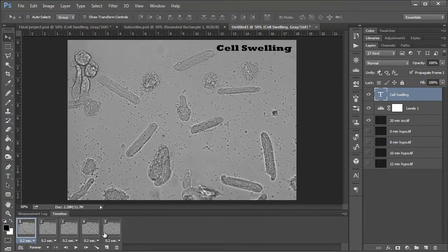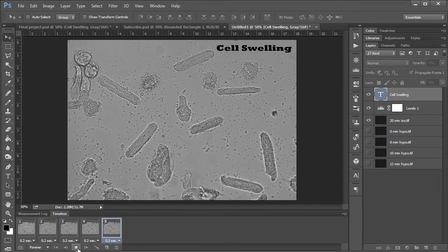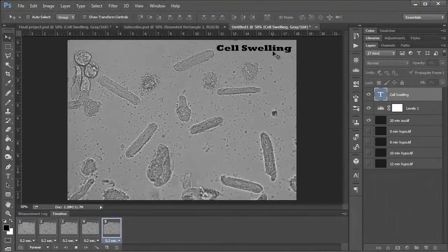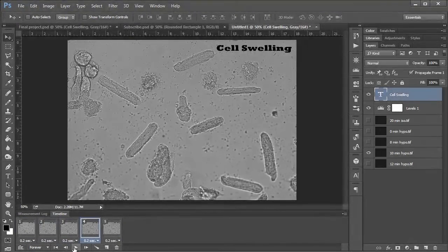And in theory, this should stay for the entire course of the video. So it just kind of sits up there. You can put it anywhere. And you can change the font to whatever you like, any title or font face. Just adding a little descriptor to your video.